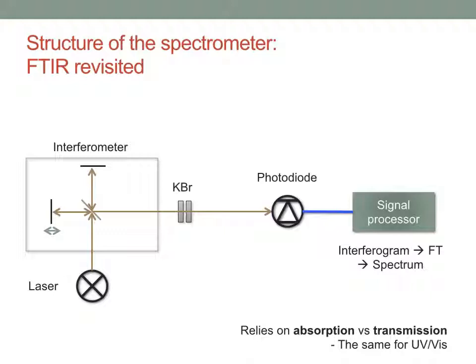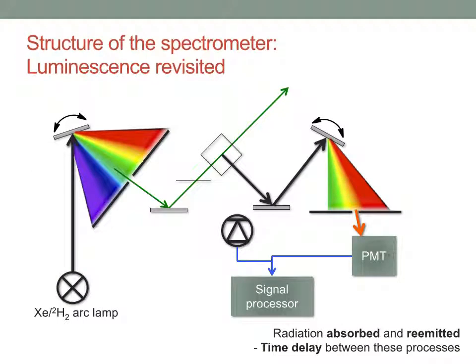Here I have essentially a fluorimeter. This is a sketch of a fluorimeter, but I already have mentioned that when we calibrate the emission from a fluorimeter, I'm going to use the water Raman, because it's a very, very simple thing in order to calibrate my fluorimeter. But this gives me the basic schematic of how a Raman would work.